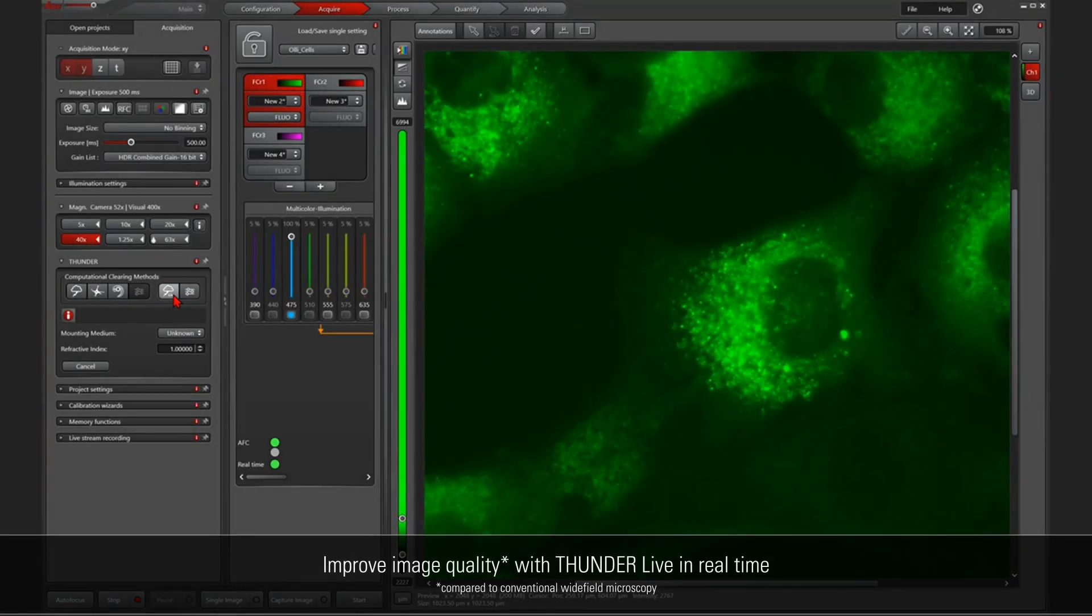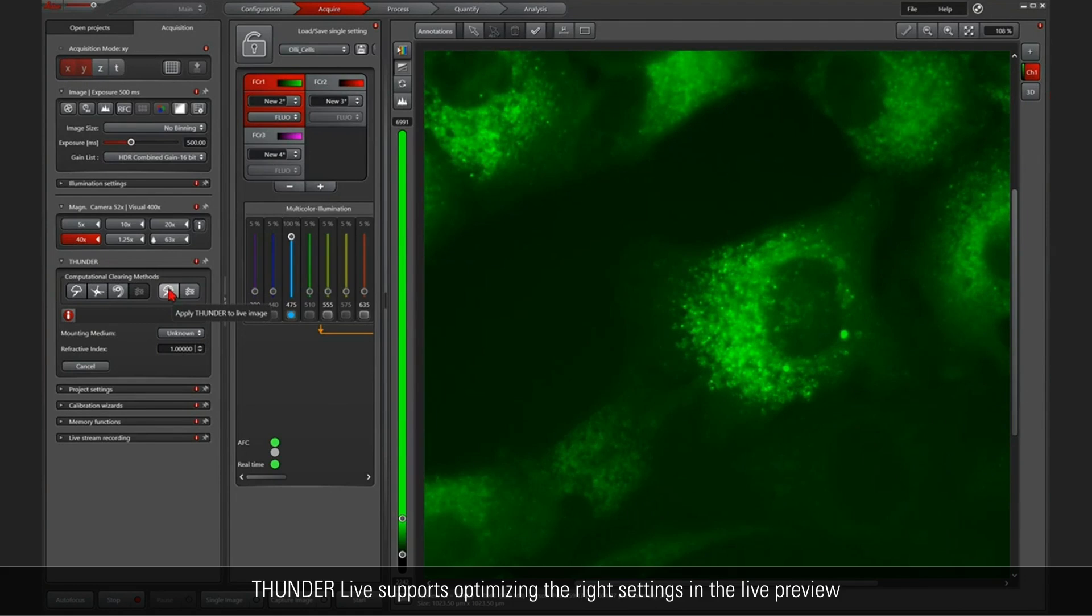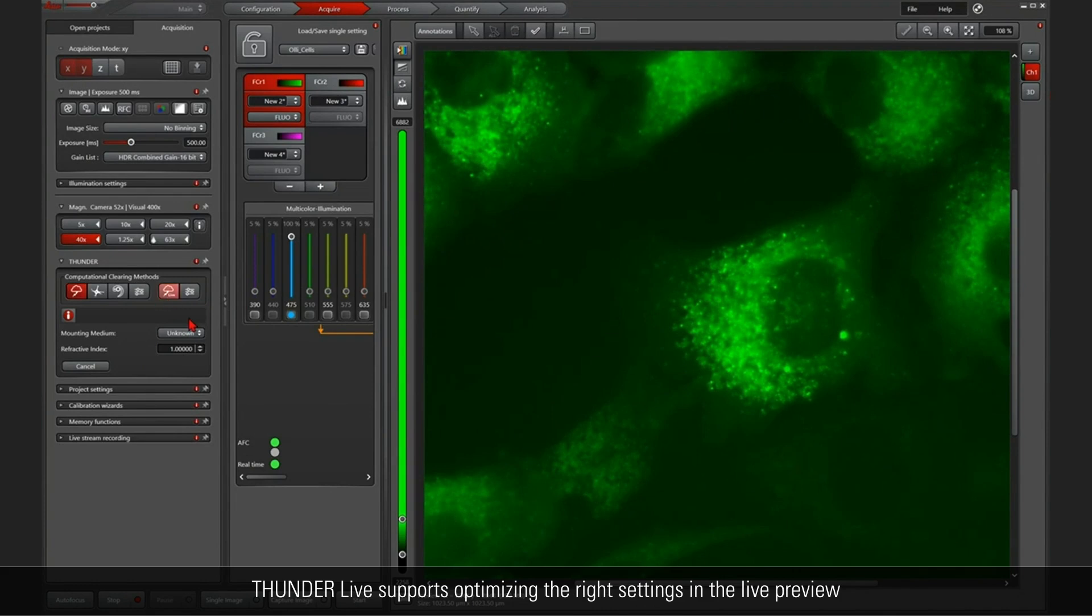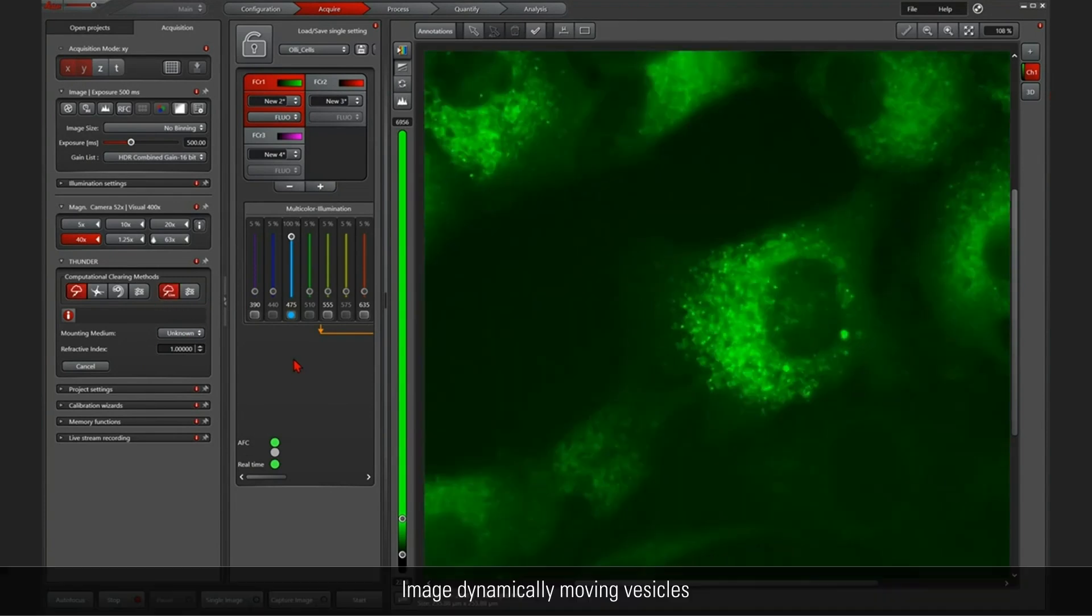Let's have a look at how Thunder Live will improve our image quality here and help us find the right setting to be able to image these little vesicles moving around.